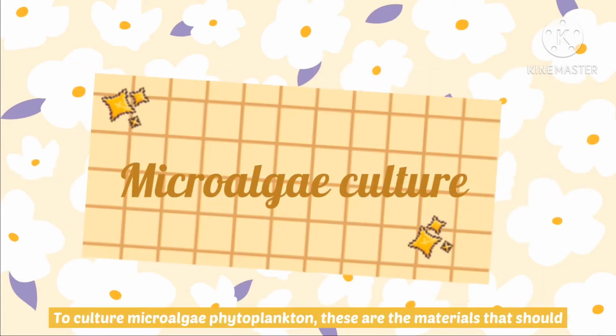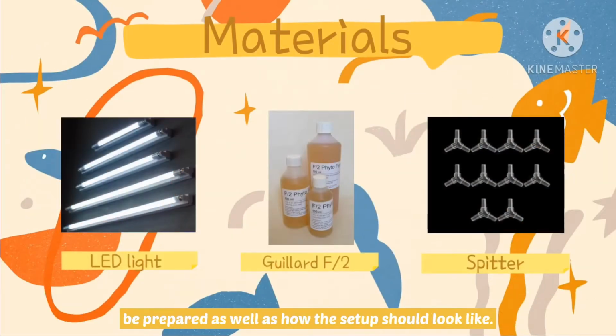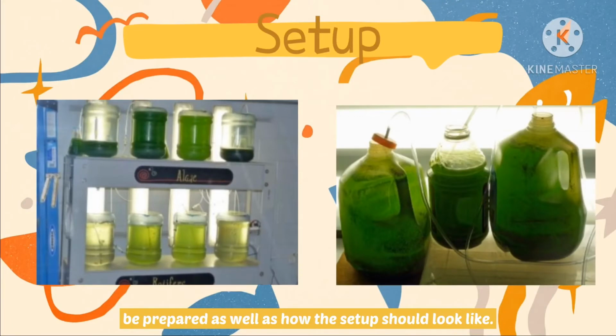To culture microalgae phytoplankton, these are the materials that should be prepared as well as how the setup should look like.